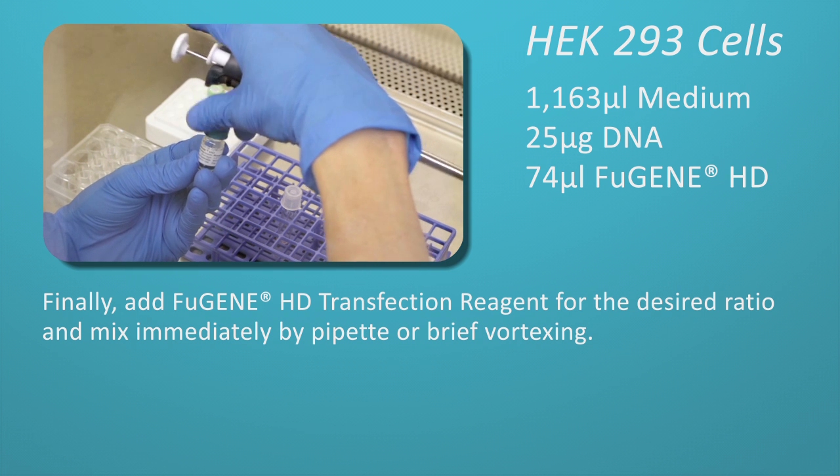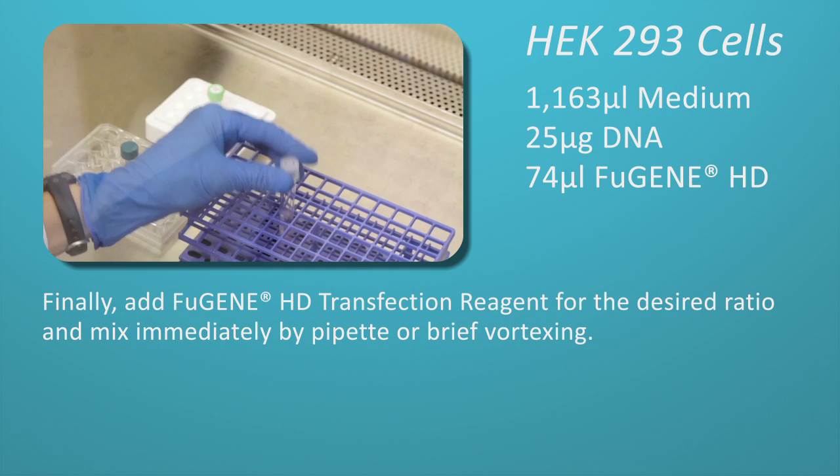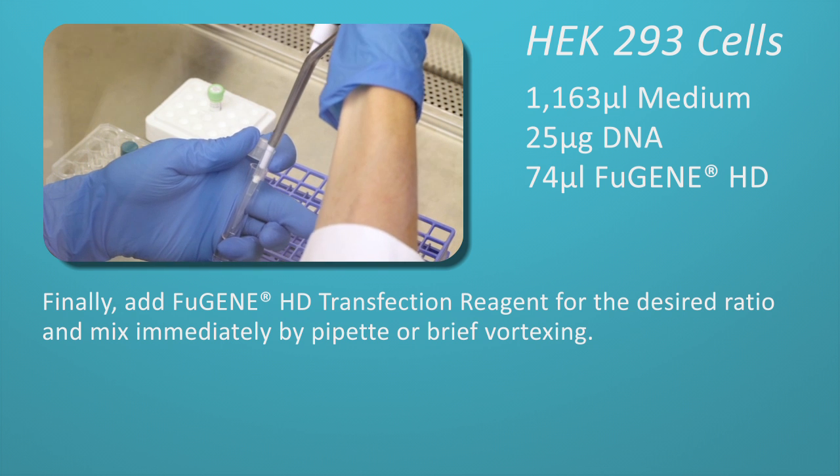Finally, add Fugene HD transfection reagent for the desired ratio. Mix immediately by pipette or brief vortexing.